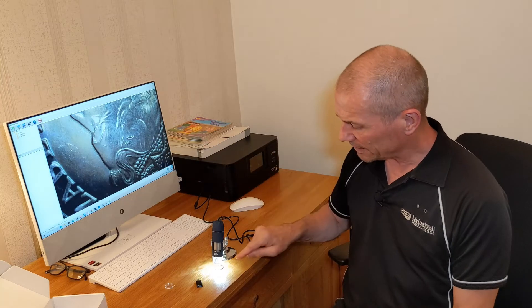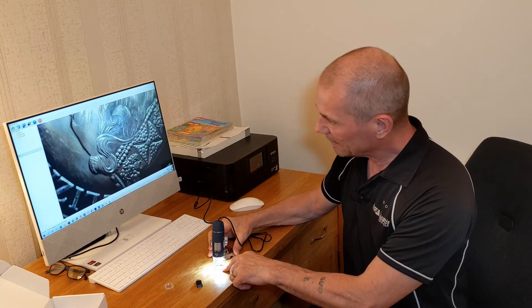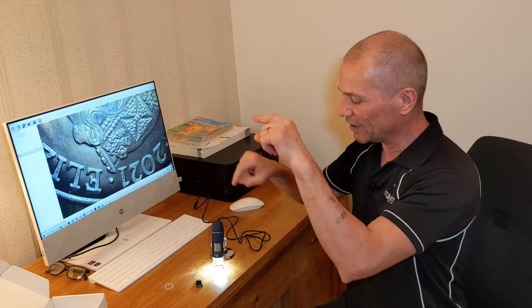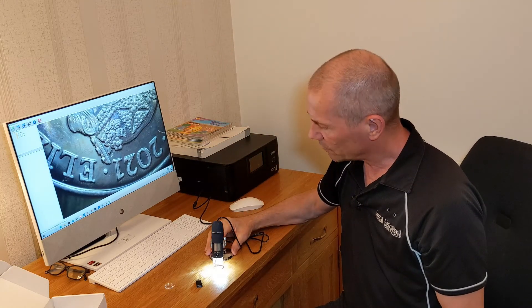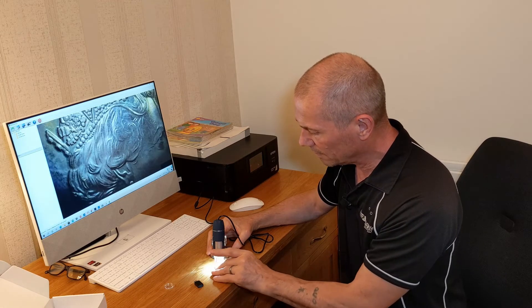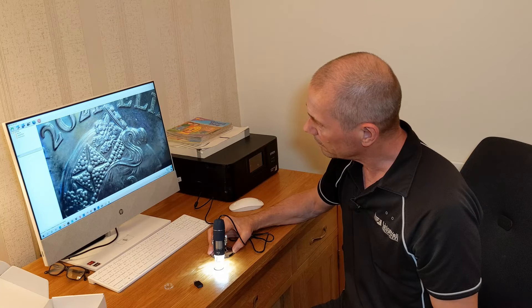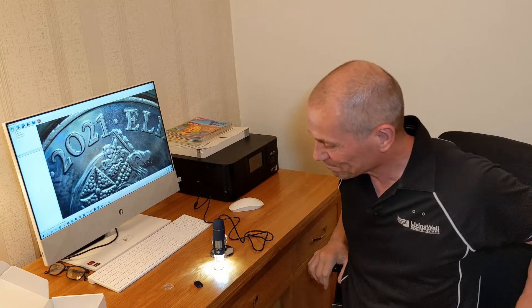All in all, for £23 I'm very happy - it's a nice little bit of kit as long as it keeps working. One thing I will say: the image is actually upside down, so it takes a bit of getting used to. You've got to look at the object, not the picture, because you're trying to position it but the image is reversed. If you want to get a specific side you have to turn the object upside down - like trying to get '2021' in frame, it's very difficult.